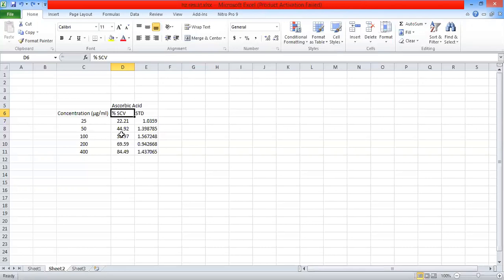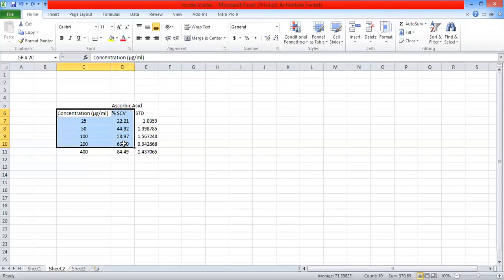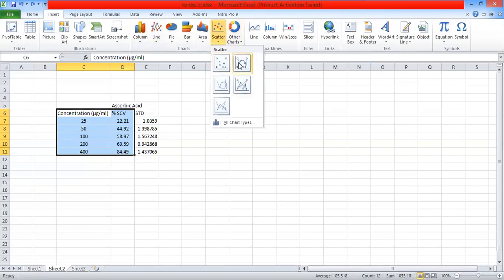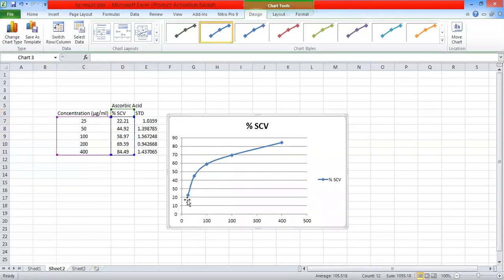Now, how can we find out that value? Let's start. First, we have to select the whole data, then go to the Insert tab and select the Scatter chart. I'm going to select this pattern and you can see a graph appears.